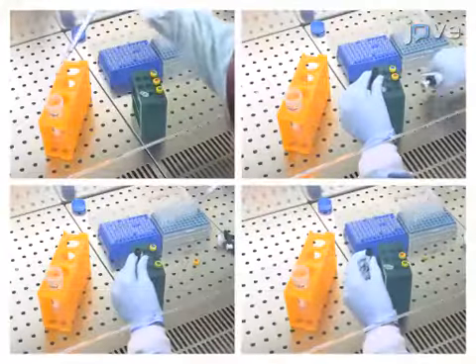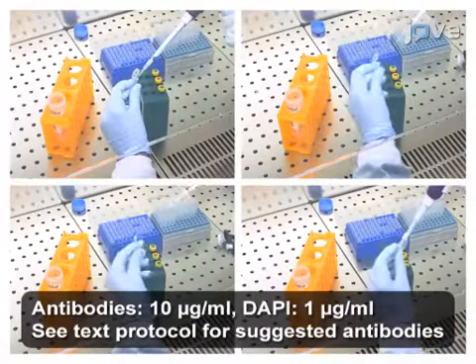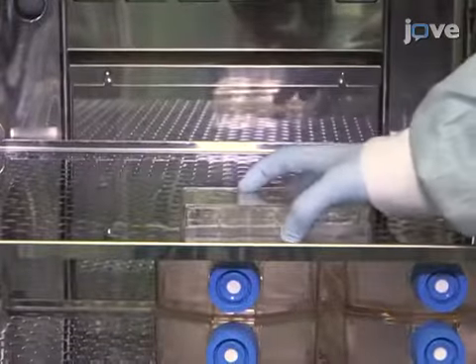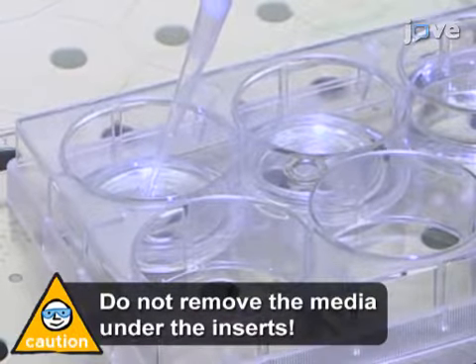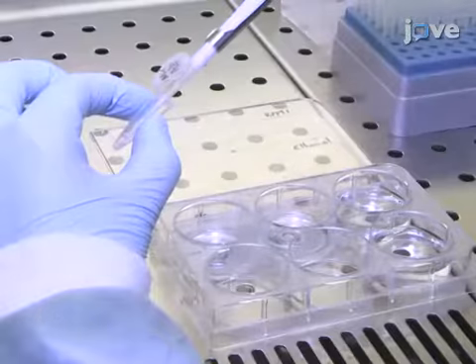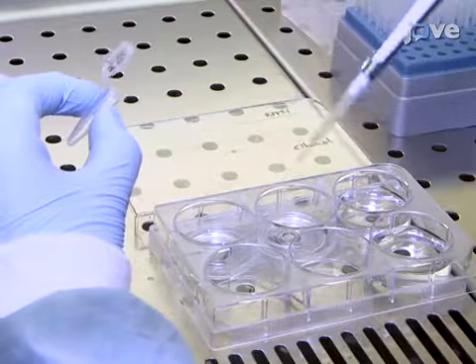Dilute the required fluorescently labeled antibodies and the fluorescent nuclear dye DAPI to the required final concentrations in phenol red-free RPMI medium. Next, remove the culture plate from the incubator and, using a fine tip, aspirate out the liquid inside the stainless steel washers. Now, without touching the slice, add 40 microliters of the diluted antibodies onto each tumor slice.